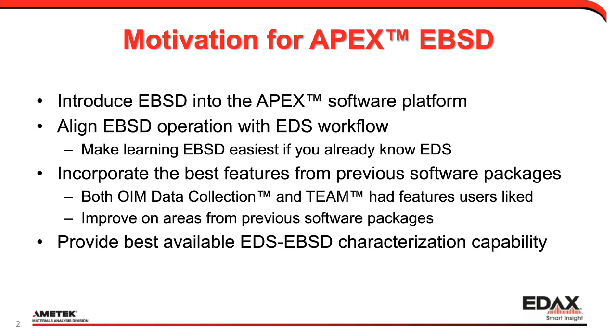As part of this, we're aligning the EBSD workflow and operation with the EDS workflow. Our goal there is really to help make learning EBSD easier if you already know how to use EDS. We want to try to reduce the barrier of entry to becoming proficient at EBSD analysis.